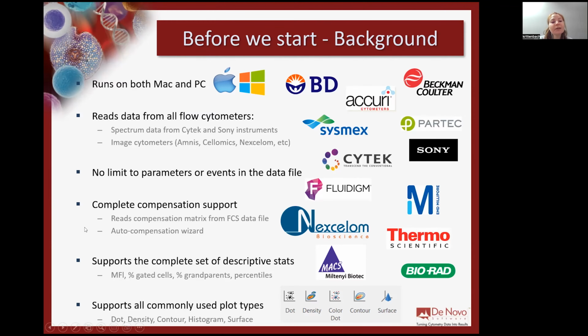We do have complete compensation support. If you compensate your data on the instrument, then that fully compensated data is going to be loaded automatically into FCS Express along with your data. You are not going to have to run compensation again. If you want to tweak your compensation, you can do that in FCS Express.